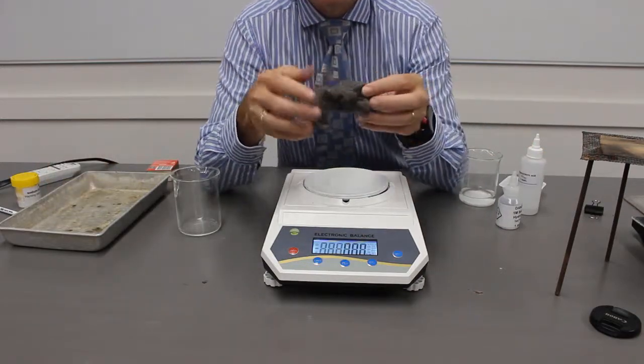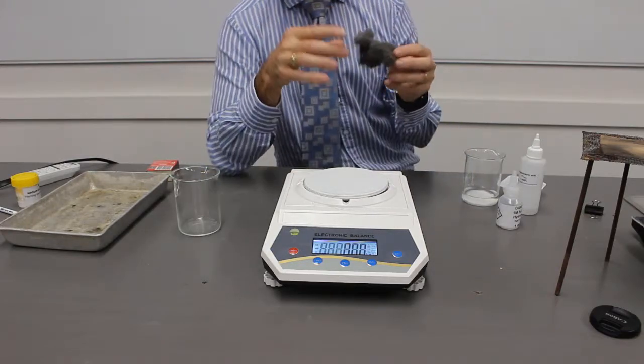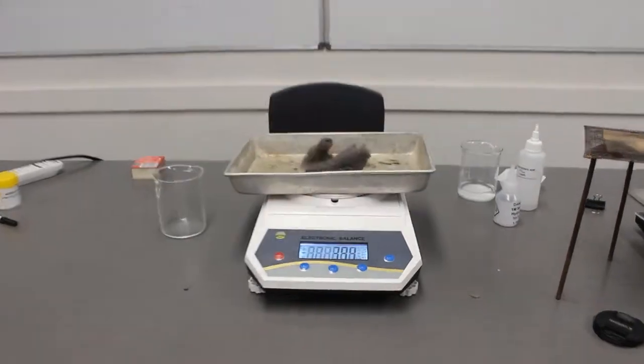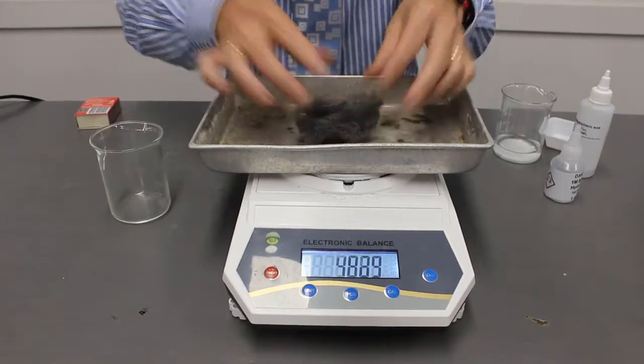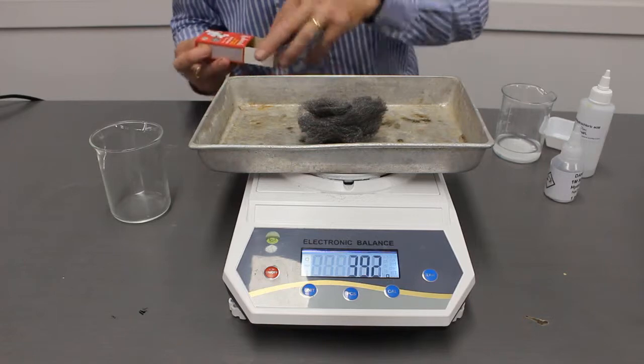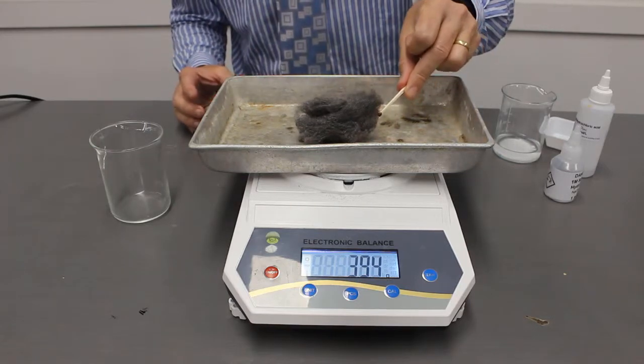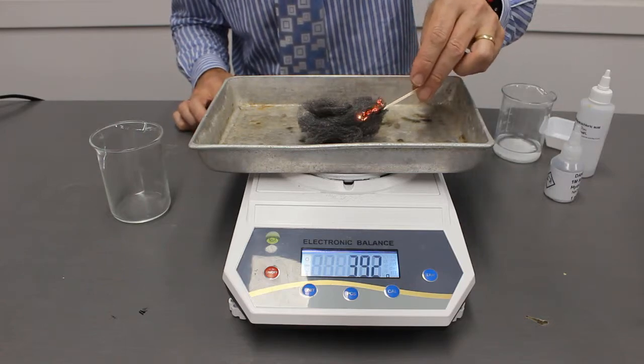This time we're going to use iron wool. We're going to get the mass of it to start off with. But first of all, I'm going to put it on this tray. And let's see what that mass is. 3.95 grams. What we're going to do is actually burn this iron wool. We're going to burn it because we're going to produce iron oxide.